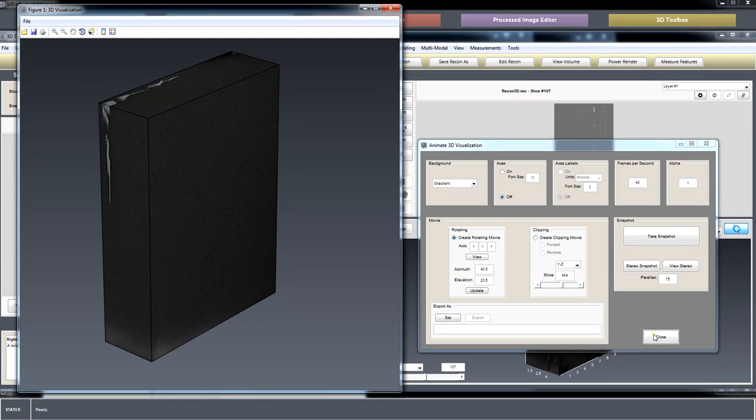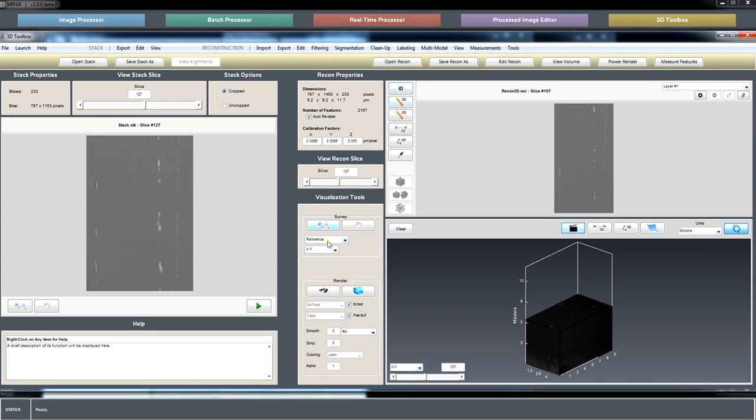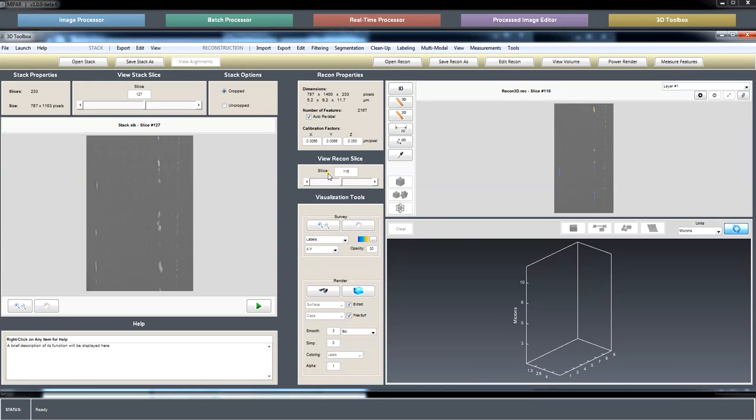Yes, yeah. If you wanted your labels view here, which is every feature, I don't need that anymore. Let me zoom in here so we can see. These are all colored according to being separate 3D features. Yes, so first thing you could do is say I want to just visualize this one.